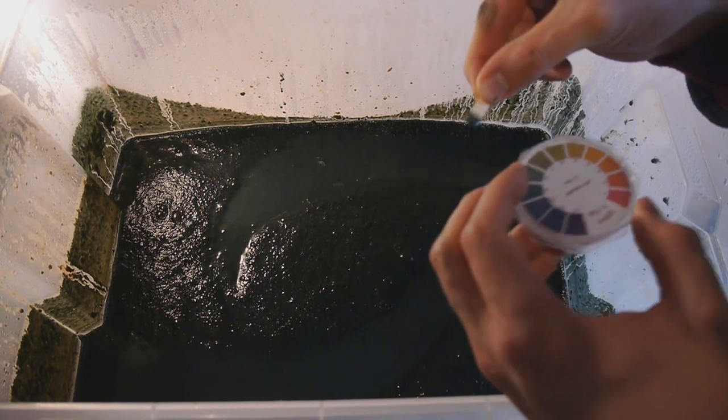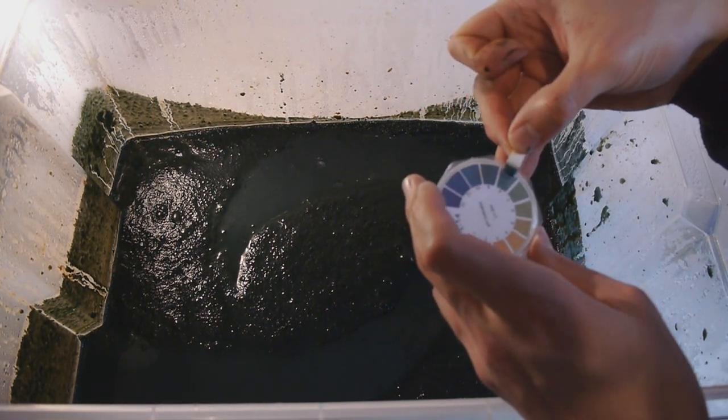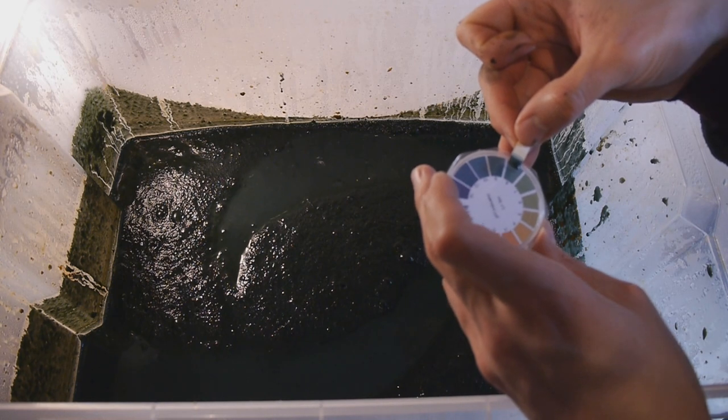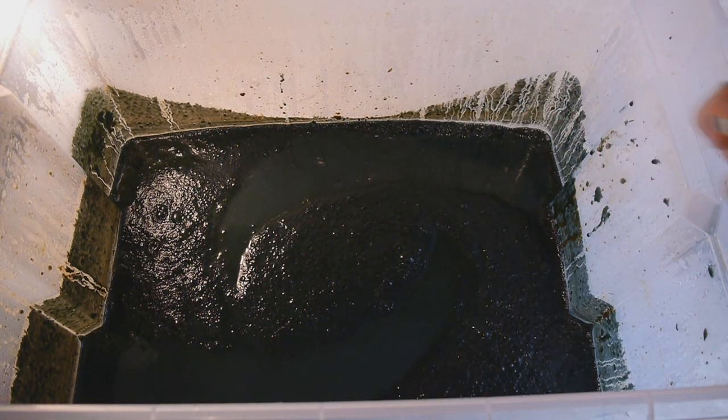Oh yeah, I think we're good. pH about 8, so that's actually absolutely perfect. I hit it spot on. It's kind of unbelievable, actually. That's great! I used exactly the right amount of sodium hydroxide, so stoichiometry works.